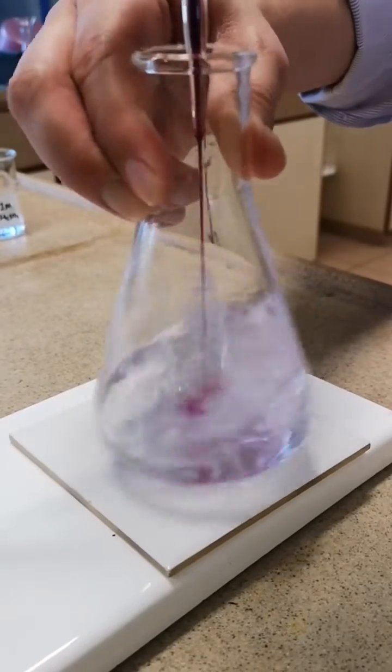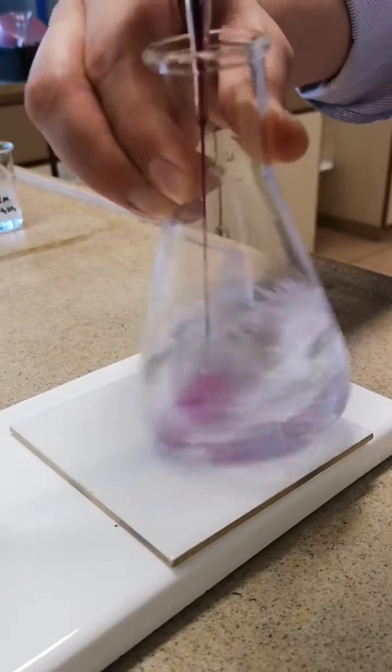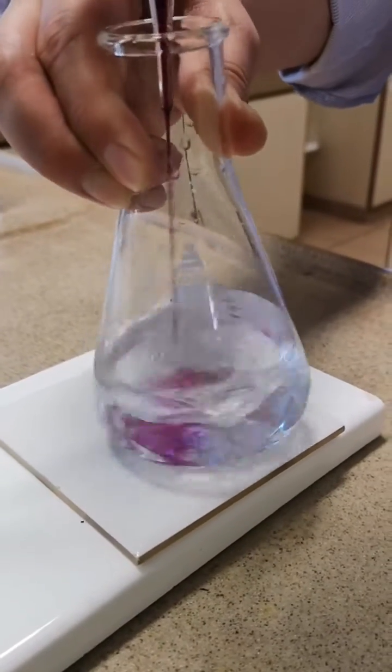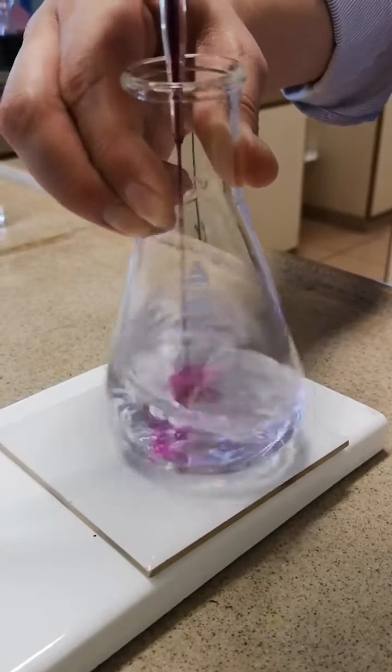We can continue to let the burette run. As you can see, the pink color decolorizes quite rapidly, and that means that we are still very far away from the end point. You should start adding dropwise near the end point when the pink color takes much significantly longer to decolorize.